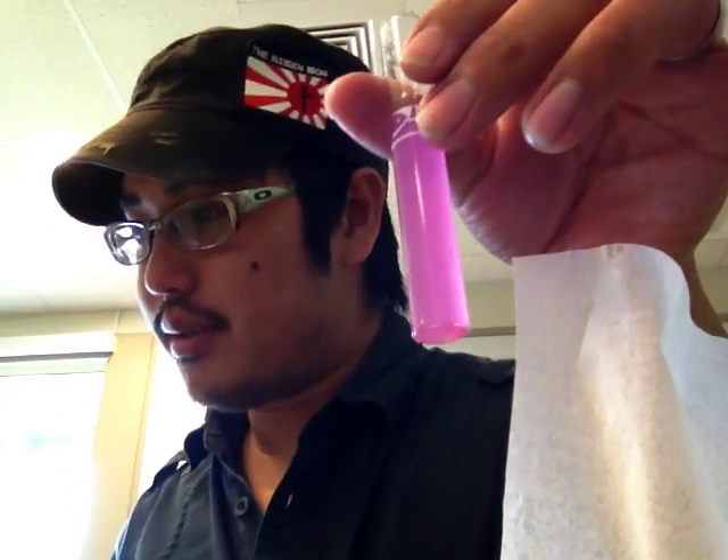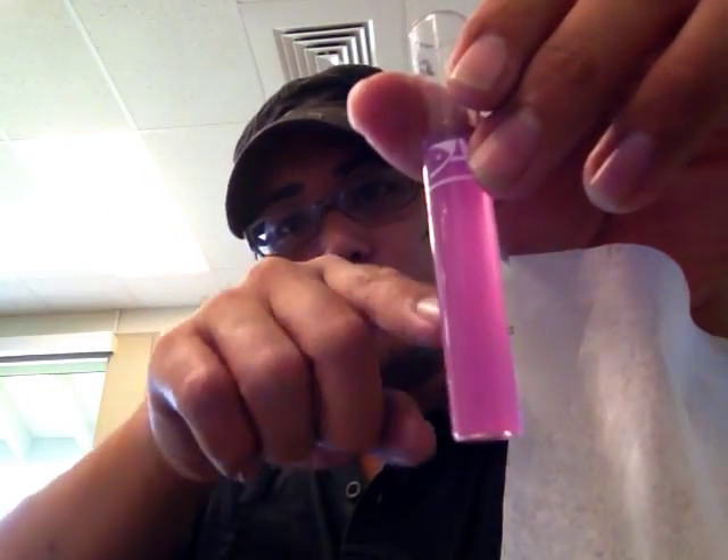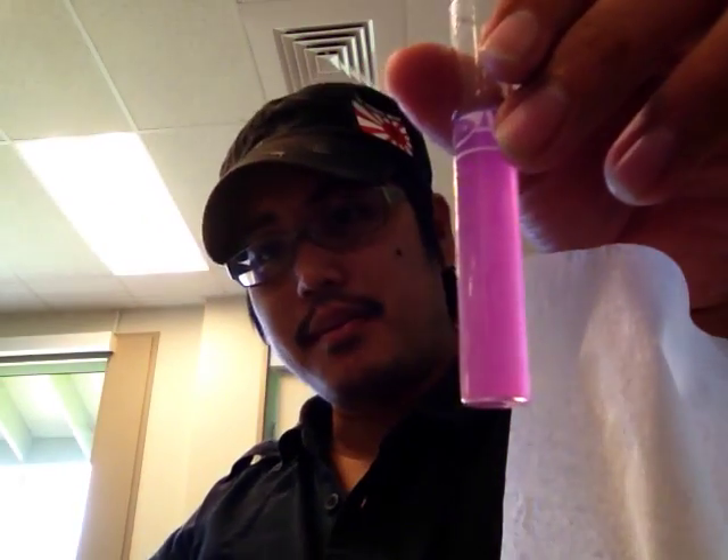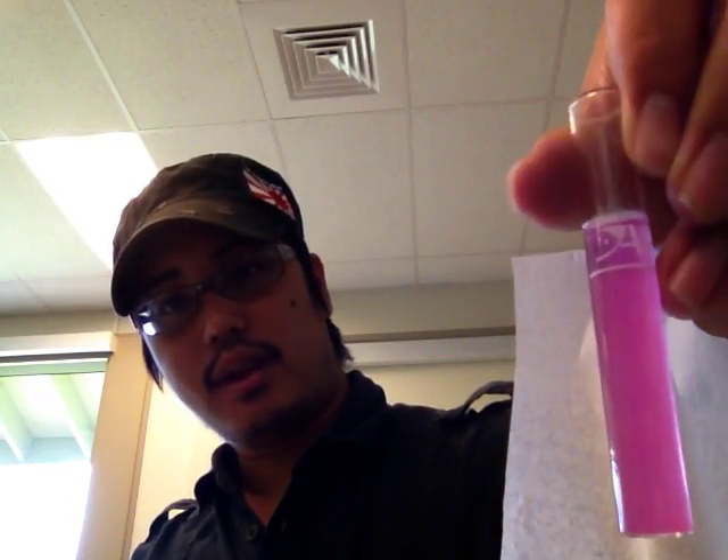What we're going to do here is test the calcium. I already put 10 drops of bottle one and 10 drops of bottle two, so any drop I add of bottle two after that is just like the 11th, 12th, and whatever drop. We're going to wait for this thing to turn blue.